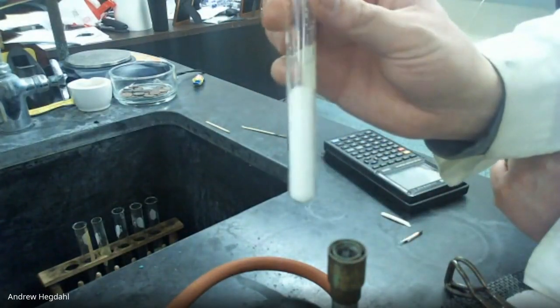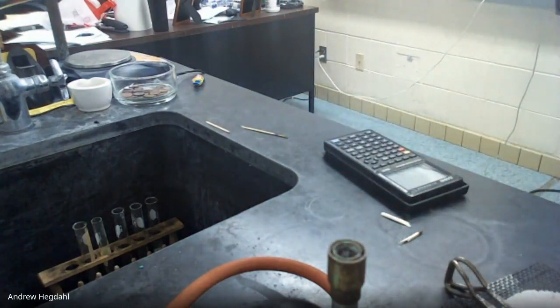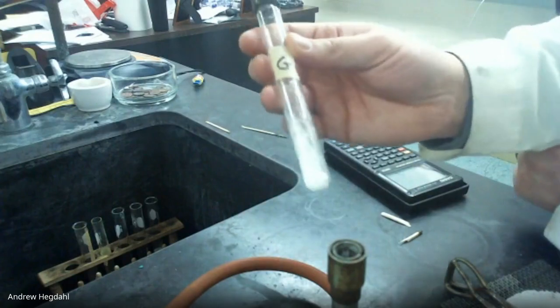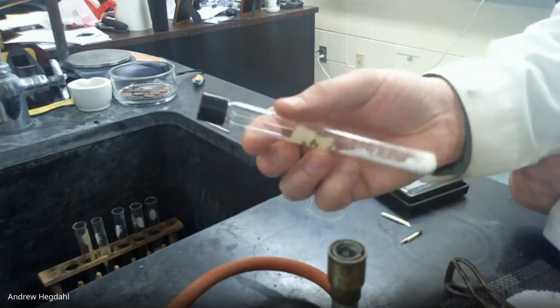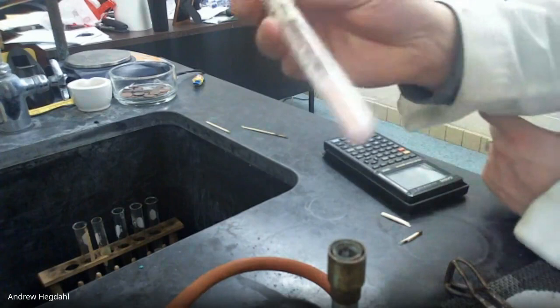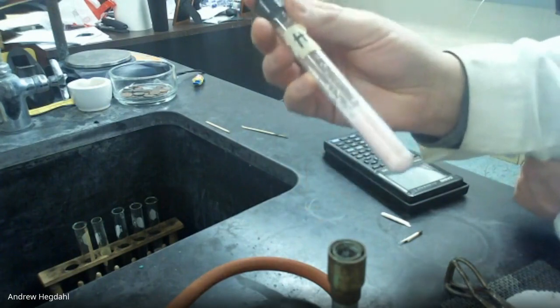F would be like, I think, just plain sugar. G is like a salt, like table salt. And then we have two left, I think. So H, this one could be like Himalayan salt. It's got a pink color to it.